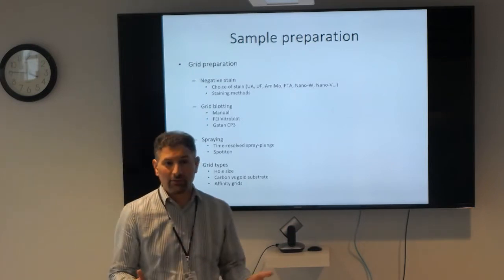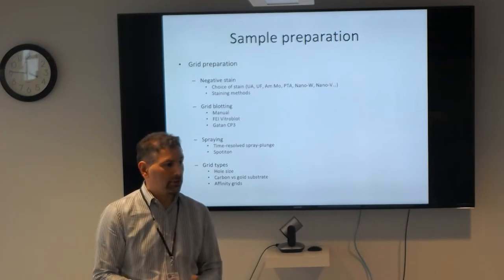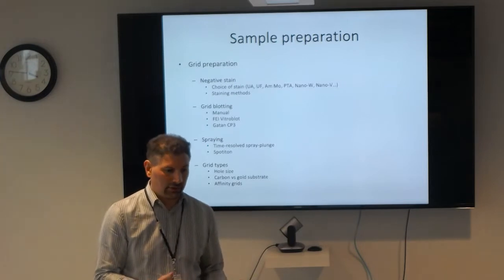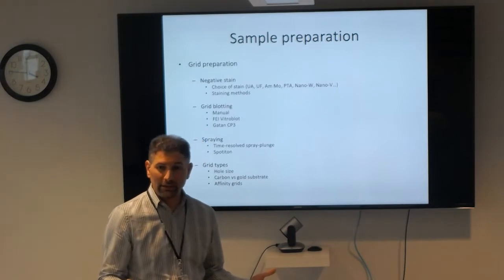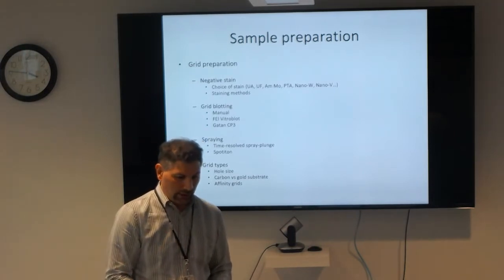You can try, obviously, the Vitrobot. You've got all these different types of robots. You've got the Gatan CP3. You've got the Leica instrument. And each one has a slightly different advantage and disadvantage to it. You can also try spraying. There's this time-resolved spray plunger.